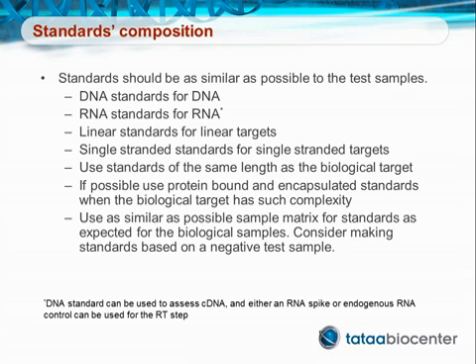If the target is protein-bound or encapsulated, we should try to use standards of similar composition, and we should use a matrix for our standards that is as similar as possible to the one expected for our unknowns. However, when analyzing field samples, we often compromise on one or more of these points.